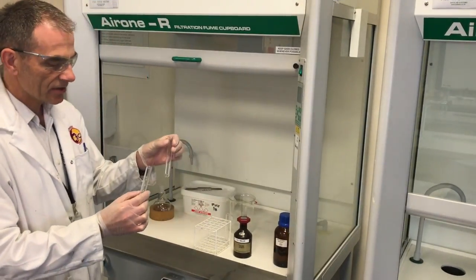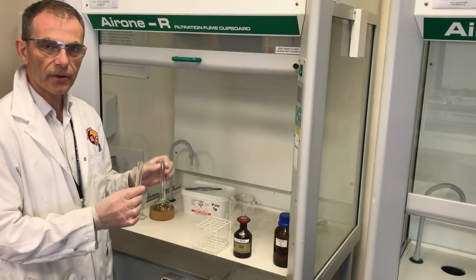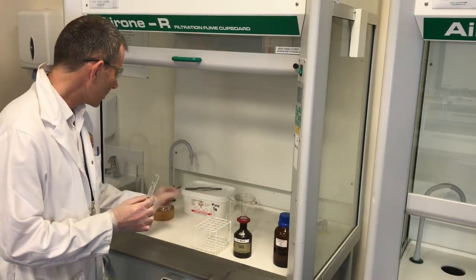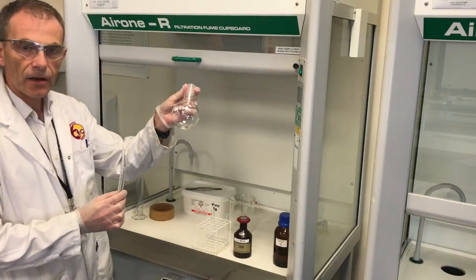In this video I'm going to show you how to do the perfect silver mirror. We're going to start with the test tube and then scale it up and do it in this round bottom flask.